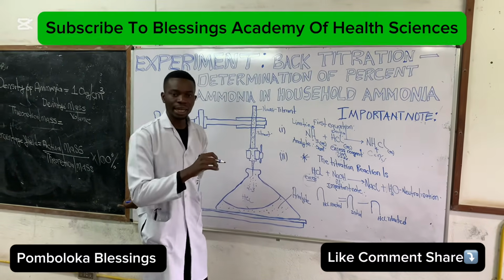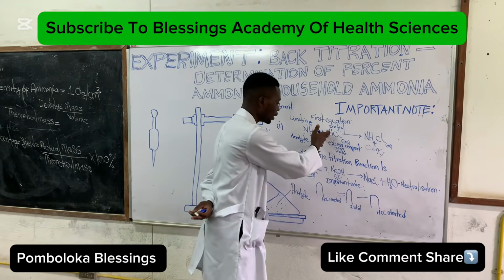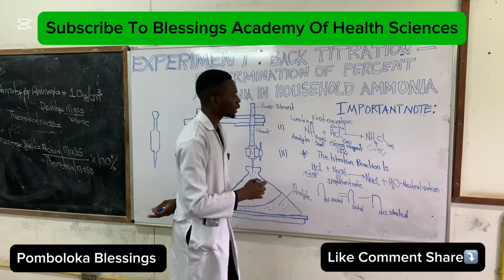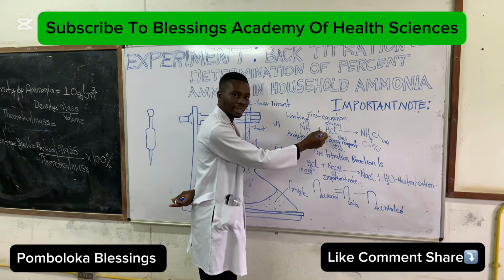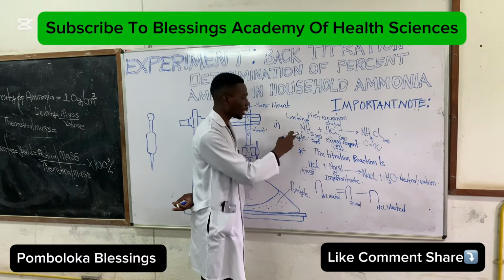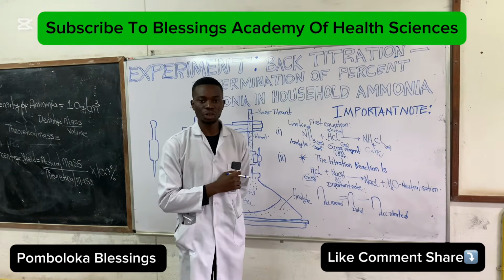Finding the difference between the initial moles and the moles of the HCl that were in excess is going to tell us the moles of the HCl that reacted in the first part of the reaction, which is going to help us find the moles of ammonia, which is NH3.